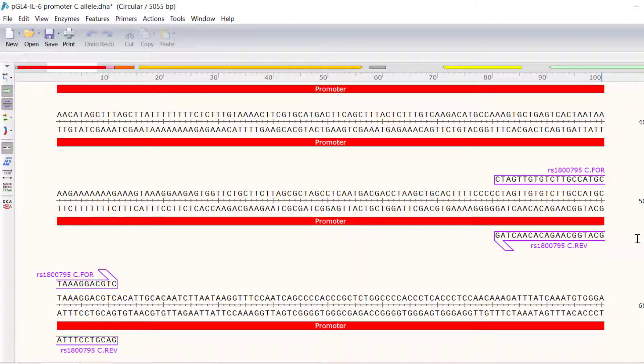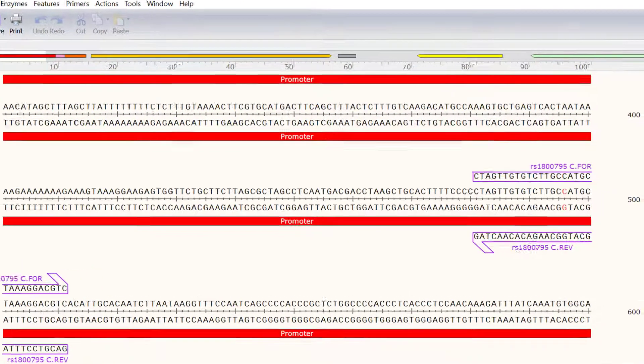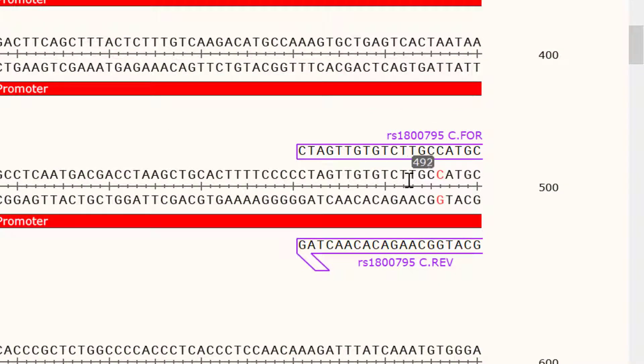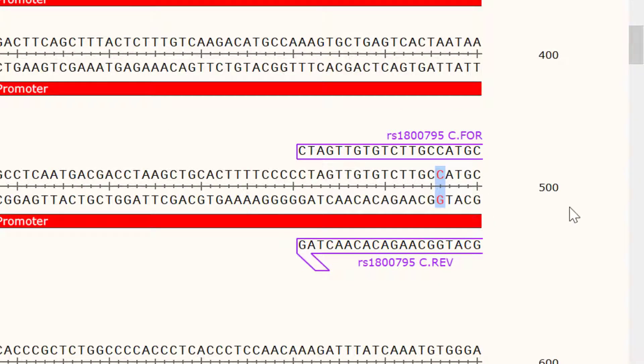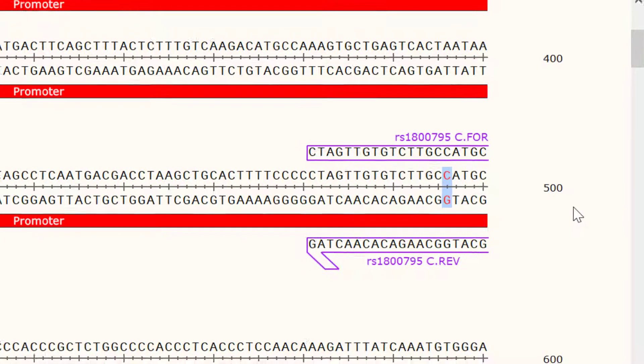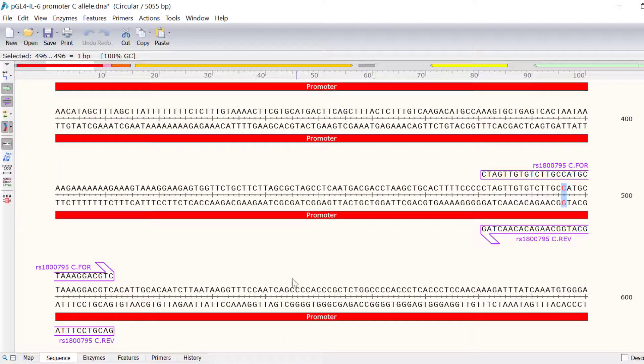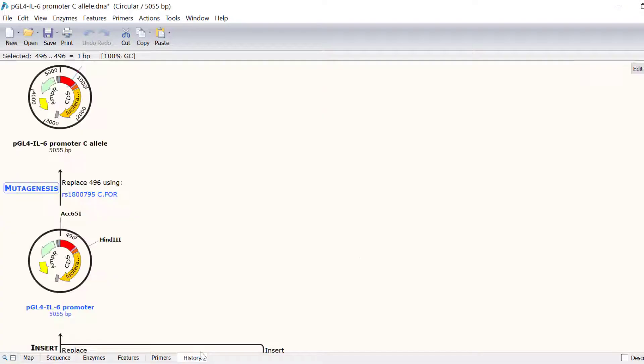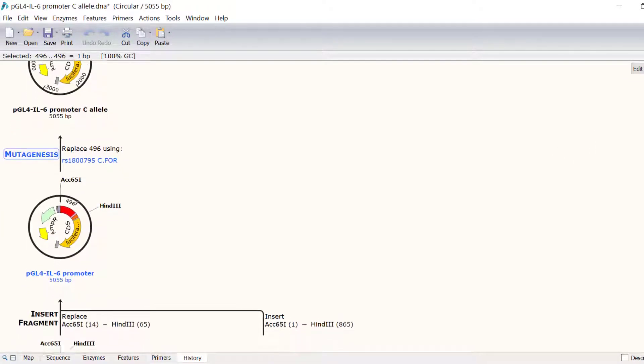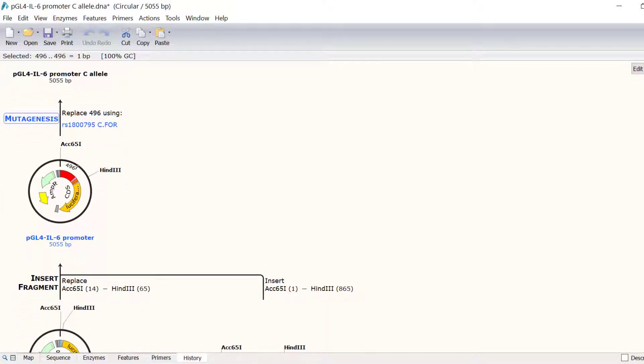With the new file open, I can click on the Show Colours button to see the base that was changed from the original plasmid. I can also switch to the History view to see how this plasmid was created. And that wraps up this video tutorial.